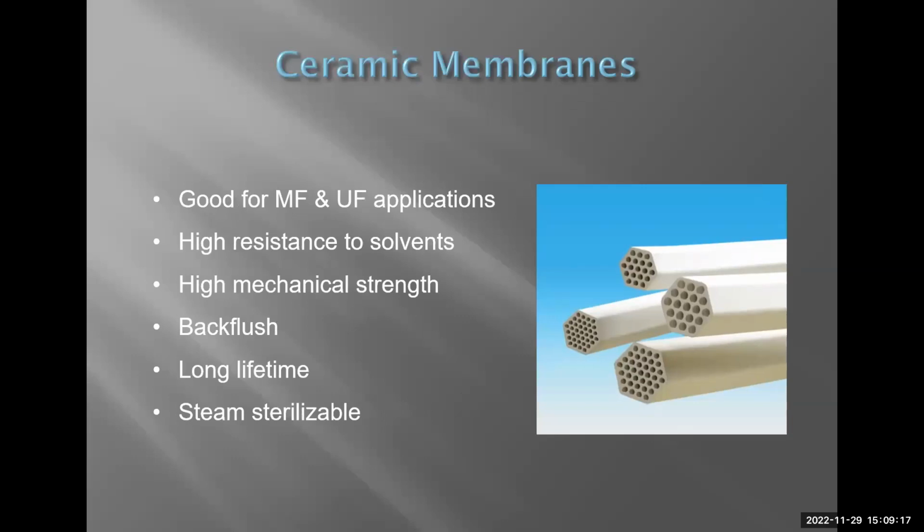They're great for MF and UF applications. They do have a high resistance to solvents. They have a very high mechanical strength. And the great thing about them is you can backflush them and you can also steam sterilize them. They do have a long lifetime. One of the downsides is they are an expensive membrane, which they try to counter with a long lifetime. So the capital cost up front is high, but the consumable cost down the line is less expensive.